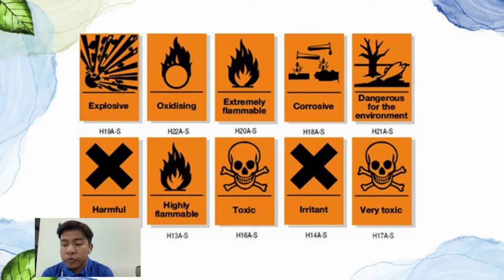They are usually found in the laboratory, such as reactivity, flammability and oxidation. In addition, there are also 5 types of safety symbols with unique signals, such as prohibition sign, mandatory sign, warning sign, safety condition sign and fire equipment sign.